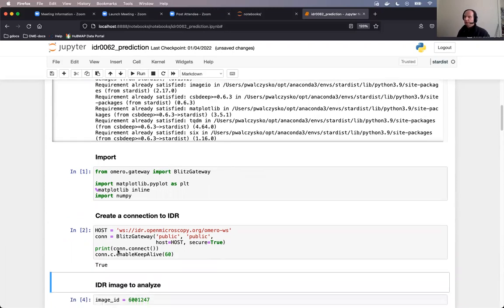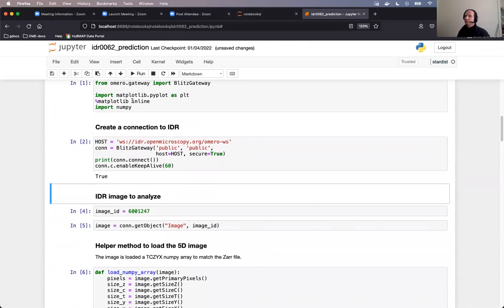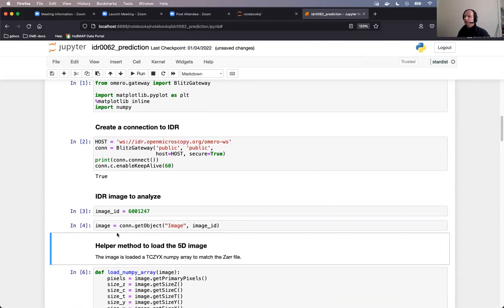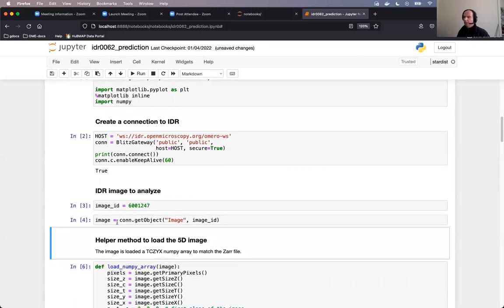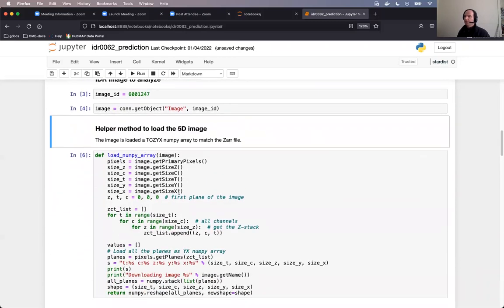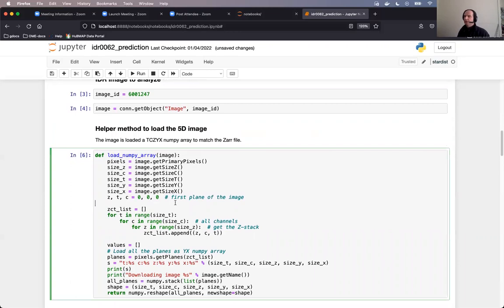We will connect to IDR. We will teach the notebook which image ID we want to analyze and just get a handle from Omero of that image, not that image itself, not the binary data themselves. Then comes a helper method to load the binary data, which basically reorders the dimensions of the multidimensional stack, which the image is.